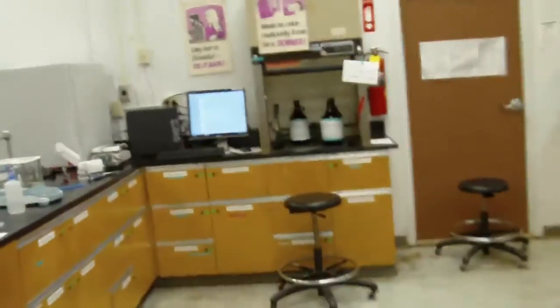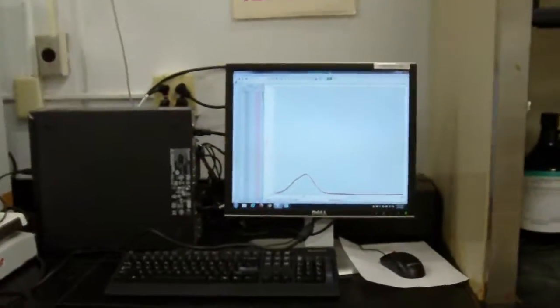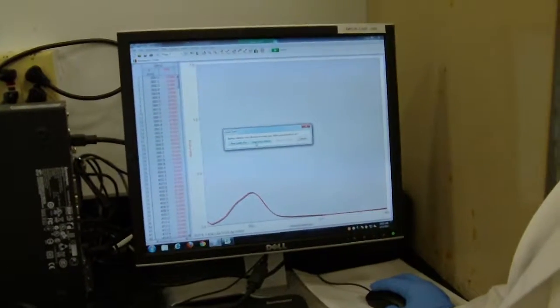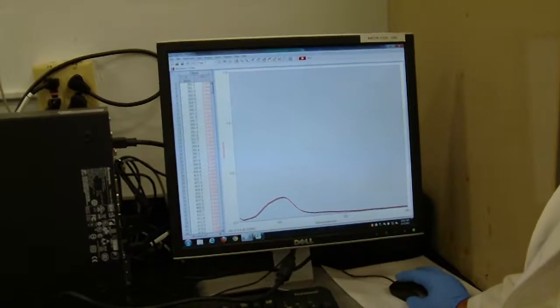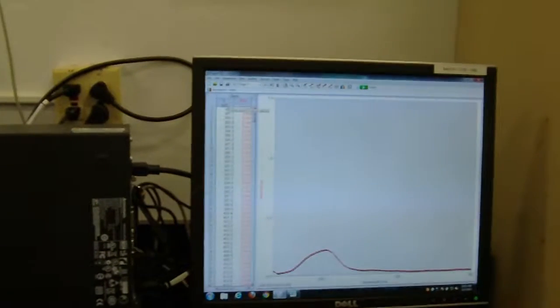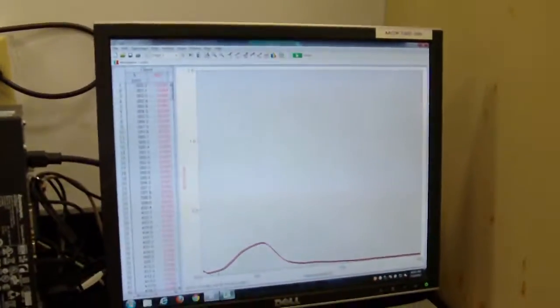All right, so now that we got the 80% solution in there, what do we do with that? Let's collect again. Okay, we can just erase and continue there, right? Mm-hmm. Now we have a new spectra, and stop it. So how do you highlight these columns? Click on one, press shift, click on the other. Okay, and then Control C for copy.